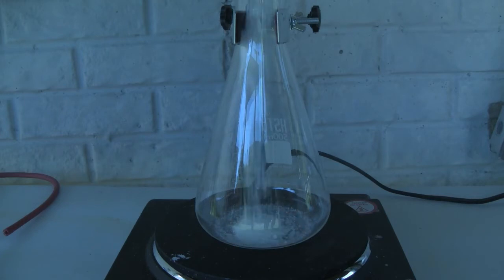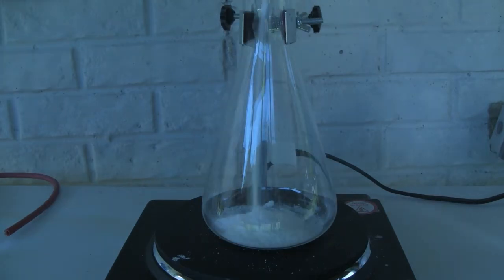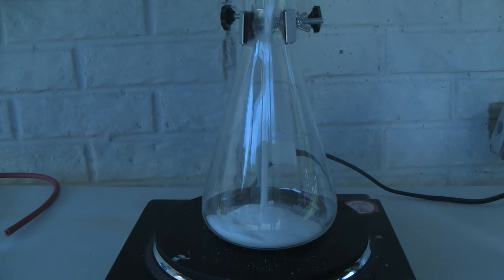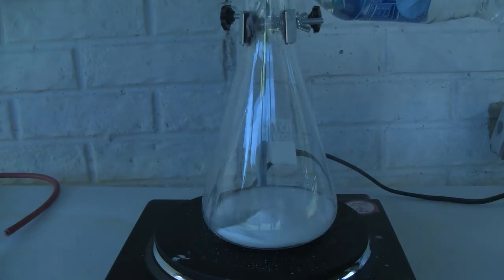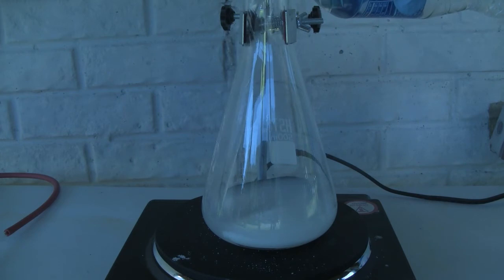To a 500 milliliter flask the sodium nitrite and ammonium chloride were dissolved in about 250 milliliters of distilled water. The solution here is a bit cloudy but this is due to the fact that my ammonium chloride source is not particularly pure.